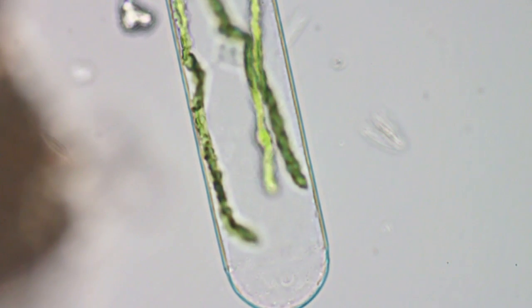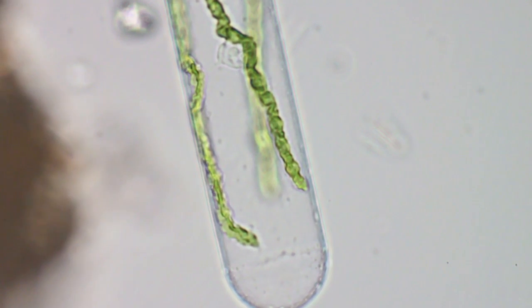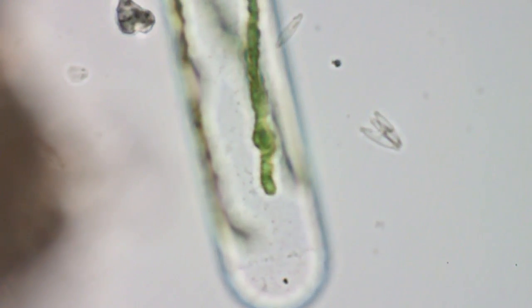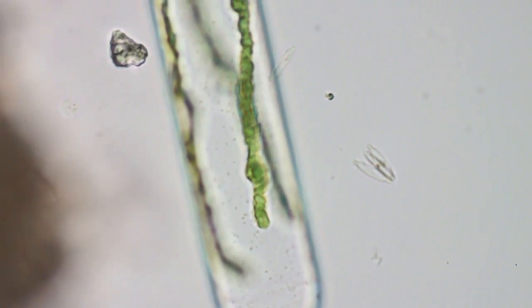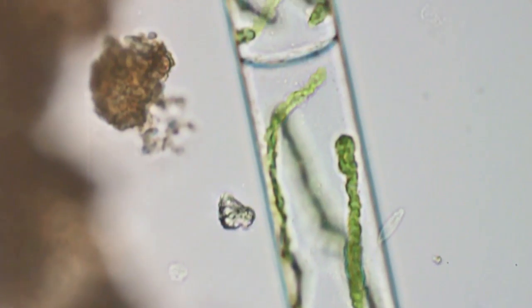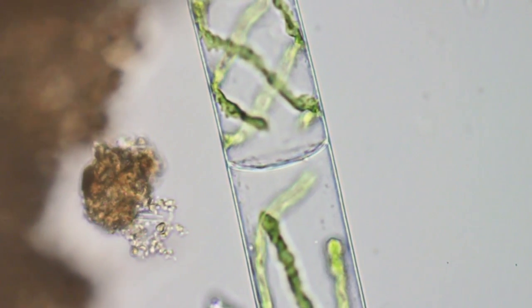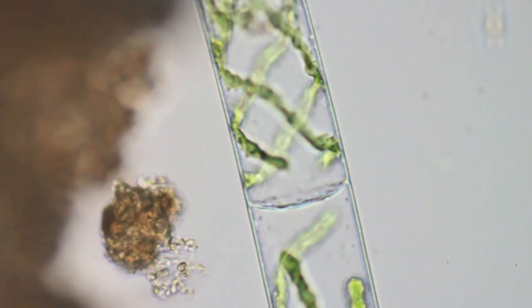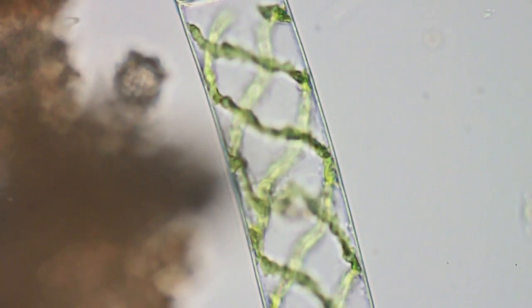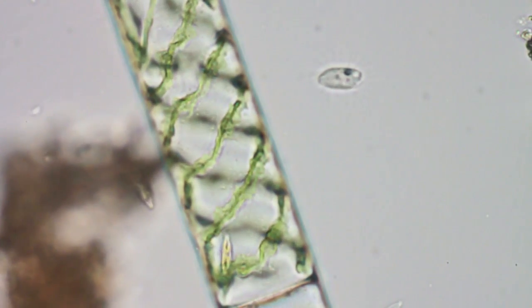I hadn't noticed that before - you can see little particles moving around inside the tube of the spirogyra. That means it's probably dead. Believe me, this is as interesting to me as it is to you - this is the first one I've ever seen. You can see I didn't notice the small moving particles when I was recording this.